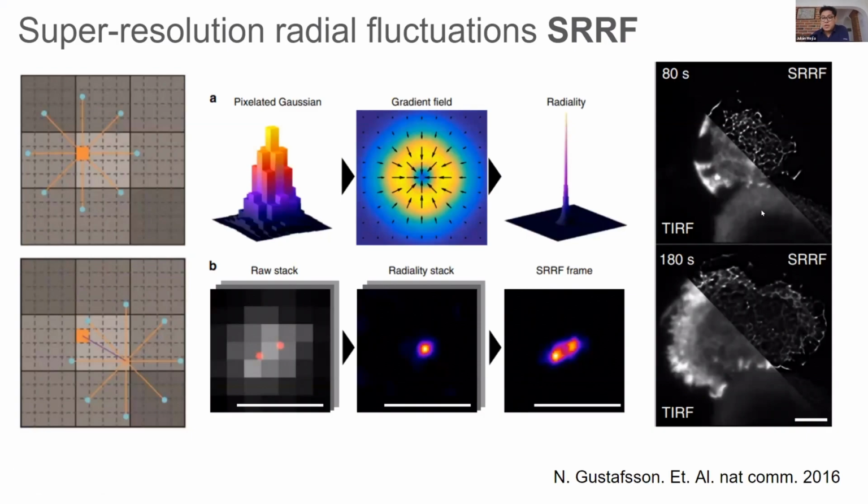It allows you to do something like this. You go from something that is quite blurry, not able to distinguish structures within it, and then you apply SURF and you have this beautiful increase in resolution. And also you are able, again, to observe structures that you weren't able to observe before. So as you see, all the methods that I have mentioned and will mention have this goal in mind: to allow you to observe things that weren't clear before. There is information over there, but there is a way to extract more and to easily observe it.